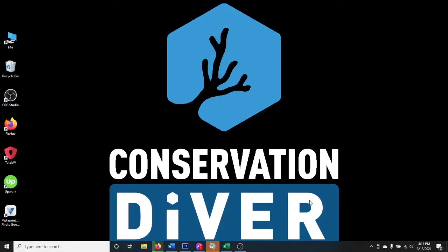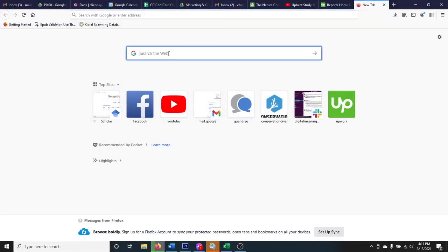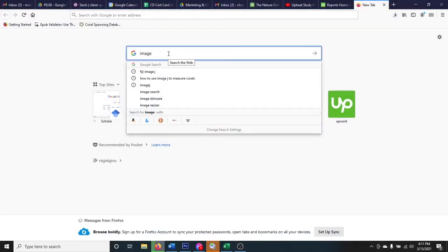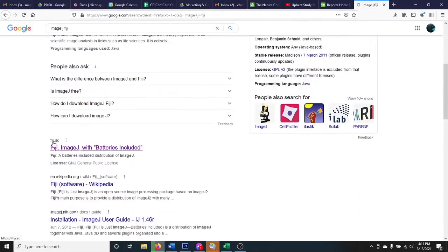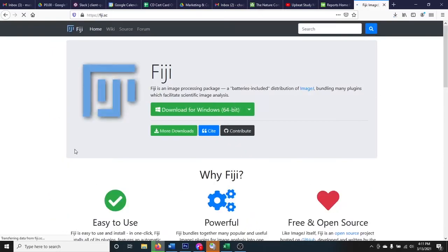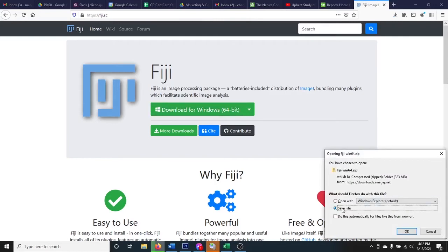The first thing we need to do is download the program. Go into Google and search for ImageJ — we're going to use the Fiji edition. The one you want to download from is fiji.sc. Go ahead and download it for your device and you'll get a zip file, so save that zip file to your computer.